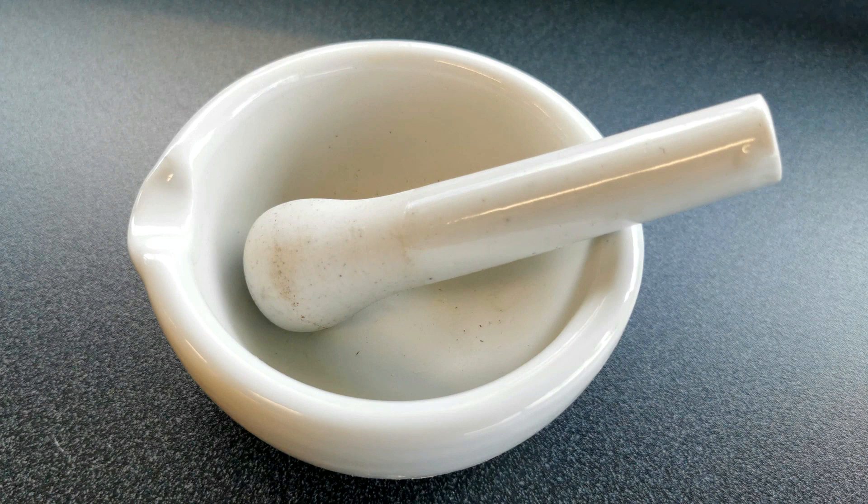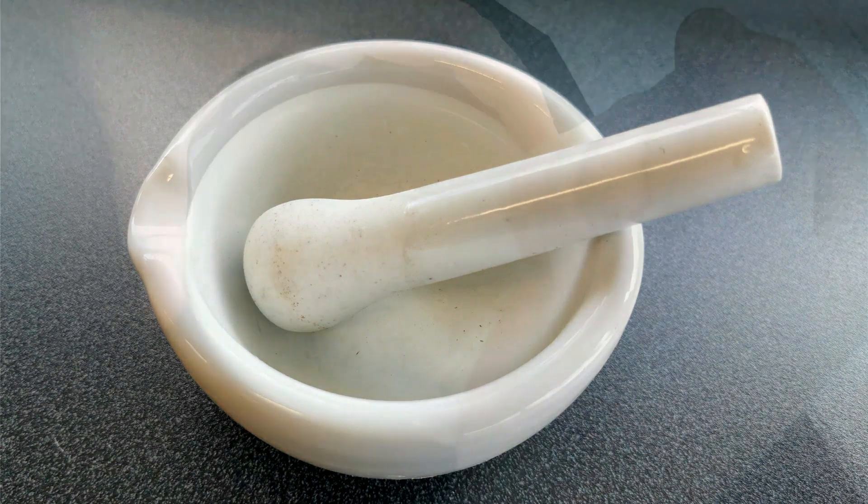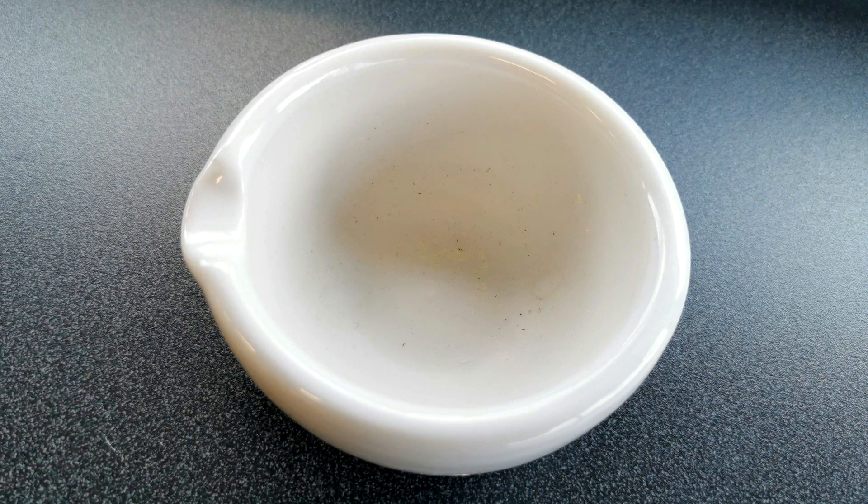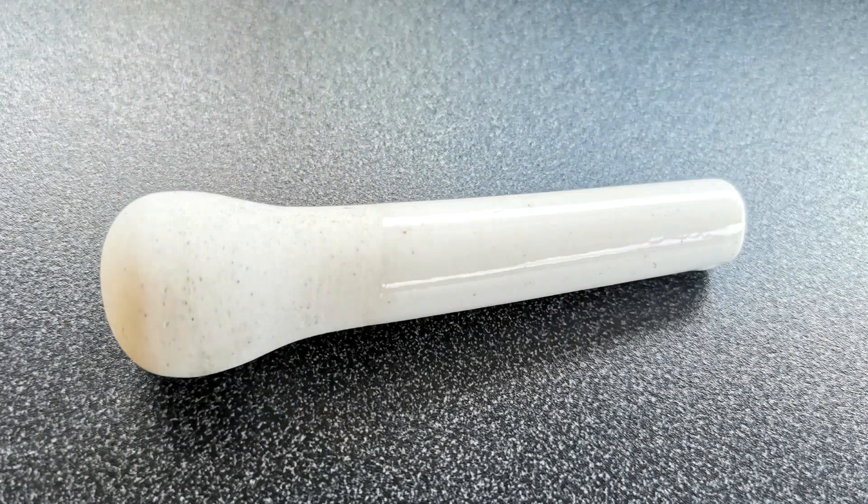Here is a mortar and pestle, used for grinding things up — in this case grinding calcium carbonate into a powder. Just so you know, the mortar is the bowl and the pestle is the rounded grinding stick. People usually just say mortar and pestle, but now you know which is which.